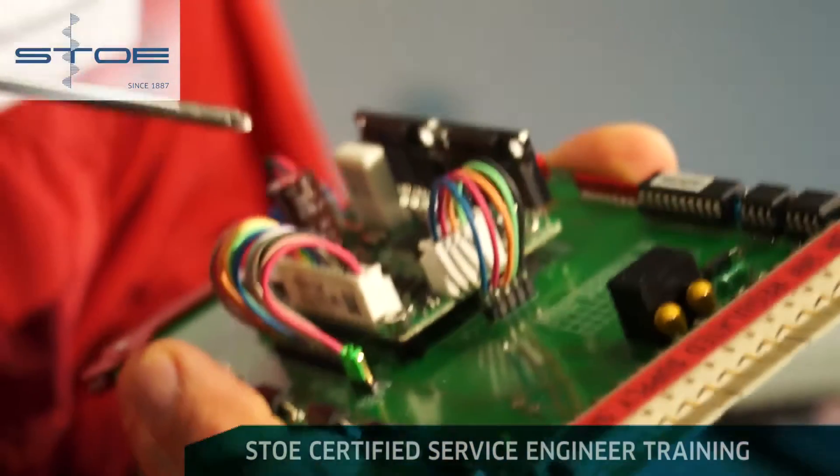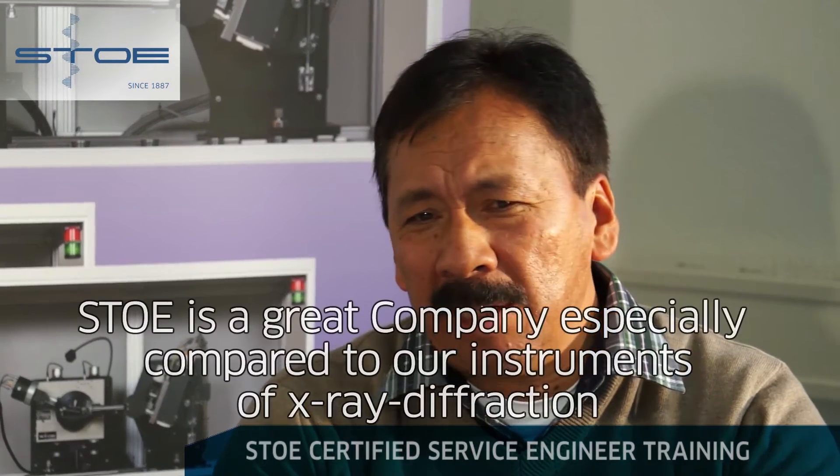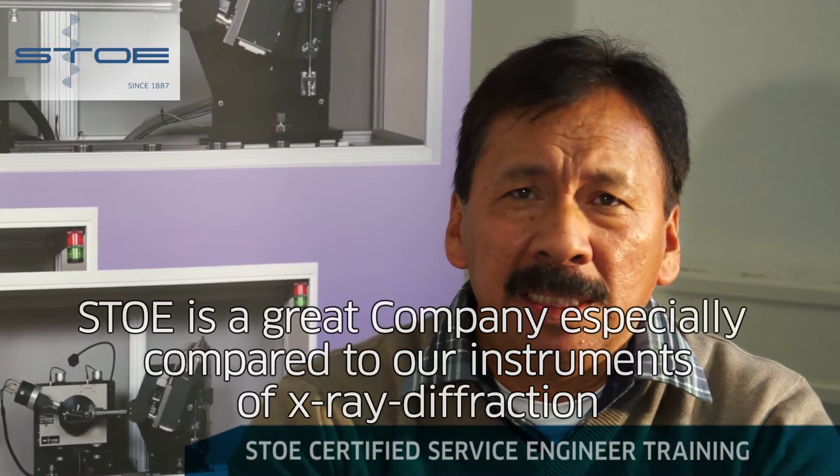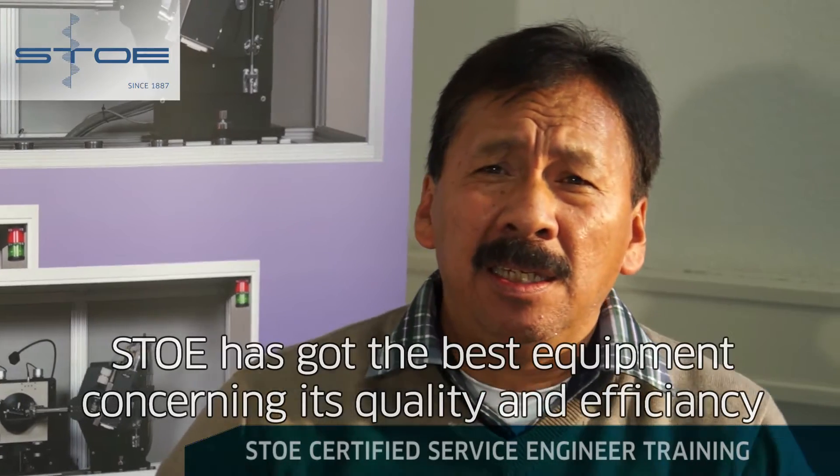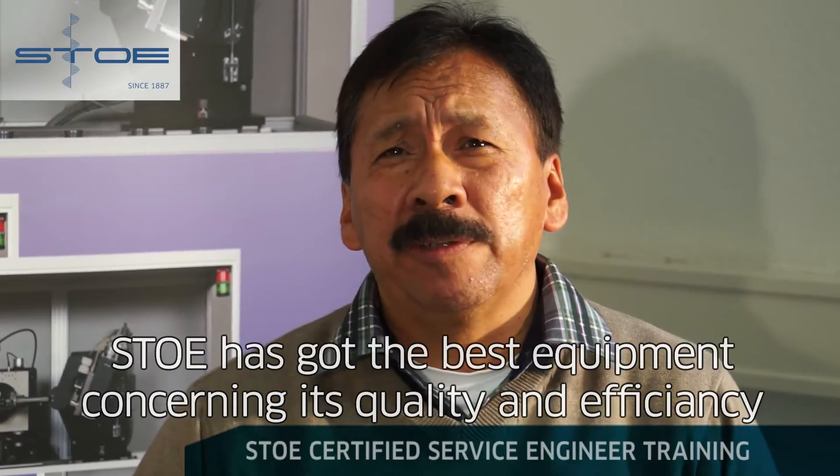Just five places. This is a big company. Compared with other diffraction equipment, I believe STOE has the best equipment.